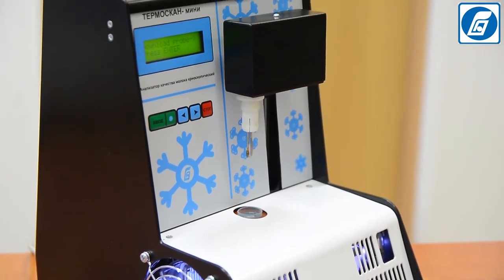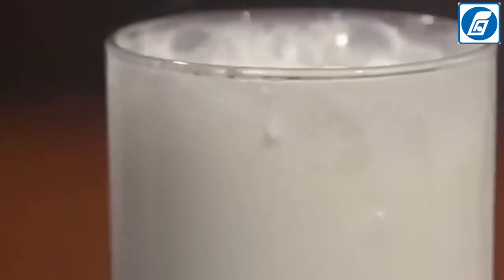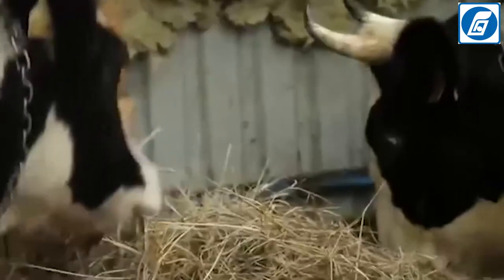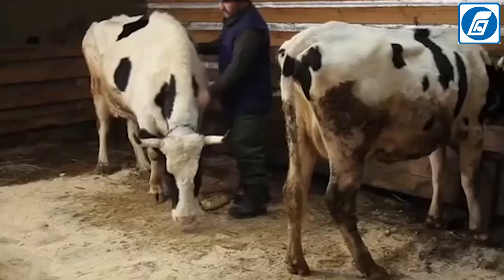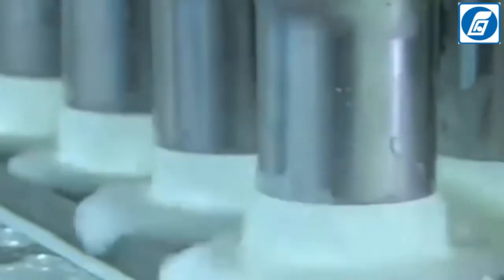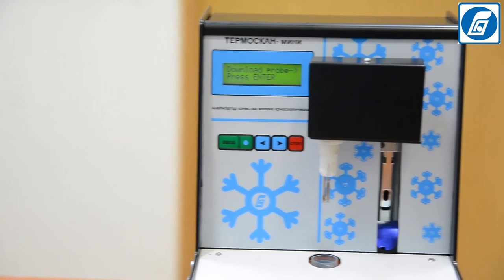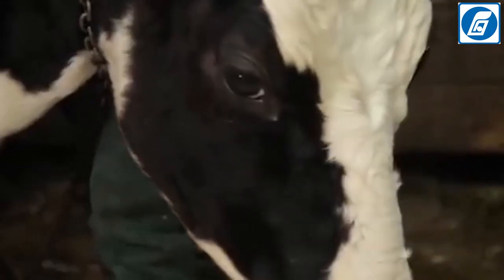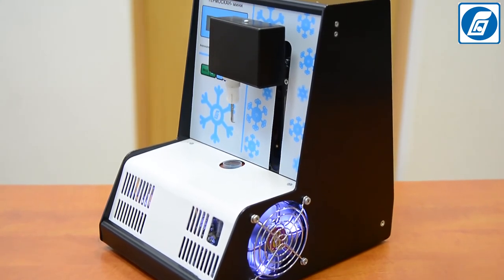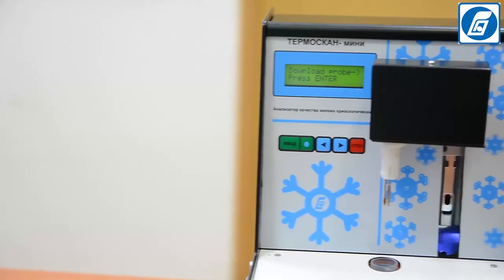The measurement time per one milk sample is 4 minutes. Currently, we are offering in Russian and foreign markets one of the most economical, cost-effective, and affordable solutions for determination of the freezing point of milk, with the best price-quality ratio. According to feedback from our Russian customers, the product has a short payback period. The affordable price and convenience for the user makes this product irreplaceable for various dairy laboratories and milk processing enterprises. Temascan Mini Cryoscope fully complies with the standards of the Russian Federation and is included in the state register of measurement devices. The manufacturer's warranty for the analyzer is one year.